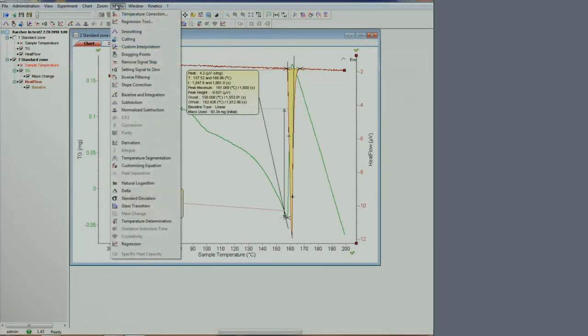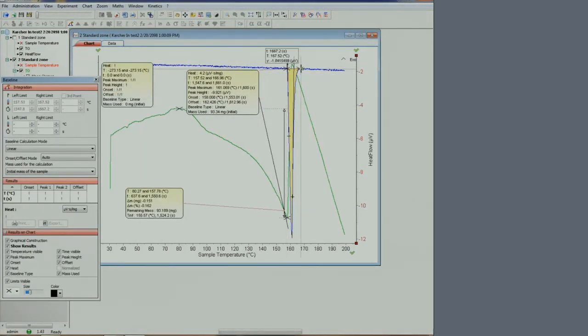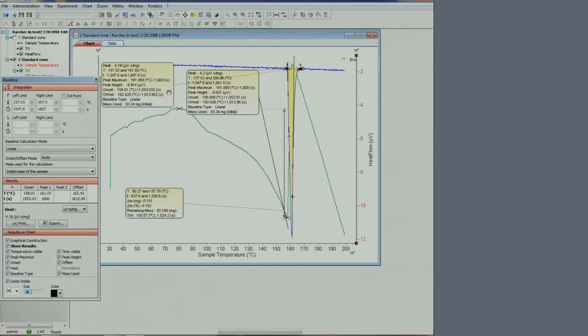On the heat flow, we can integrate the area. The microvolt per milligram area can be converted to joules per milligram using a calibration factor available from our facility staff.